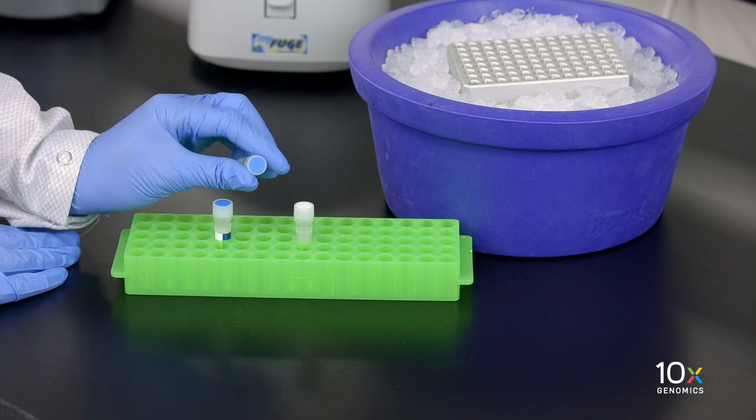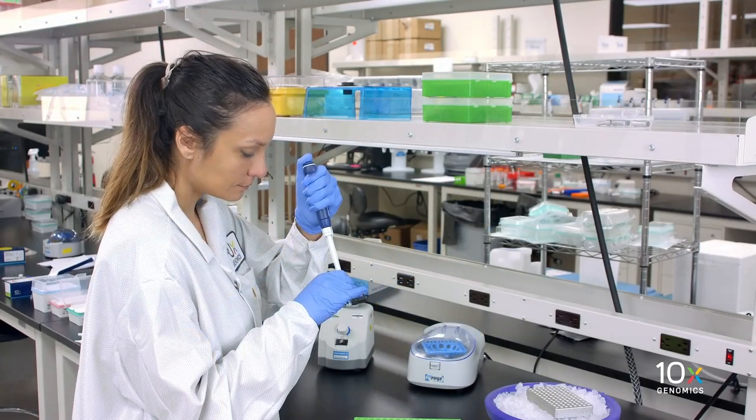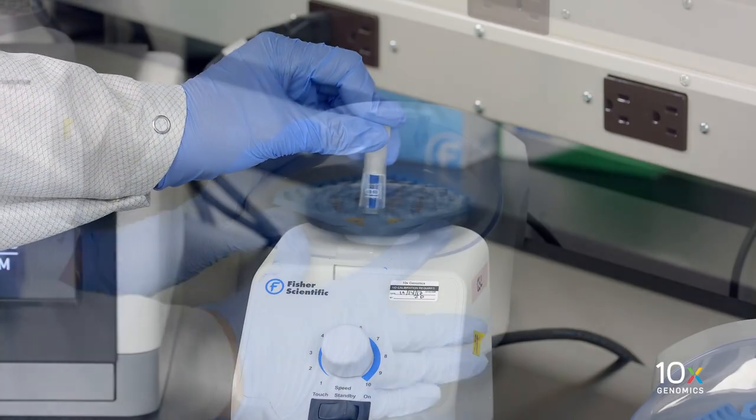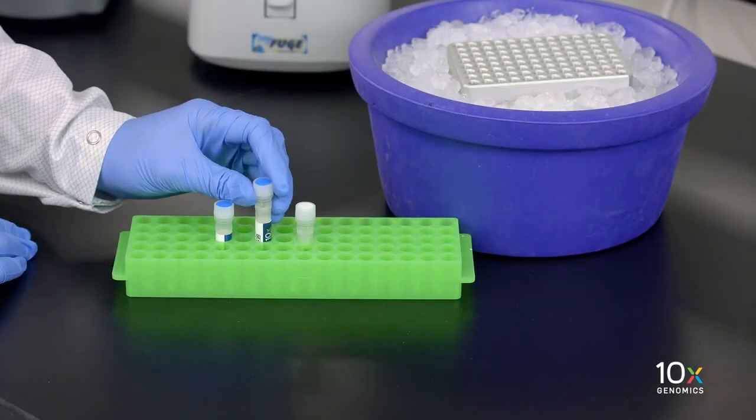Then we have our template switch oligo. Briefly spin down and re-suspend in 80 µL low TE, vortex for 15 seconds at max speed, briefly spin down, and leave at room temperature for at least 30 minutes.